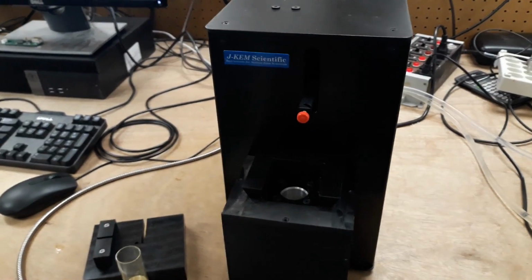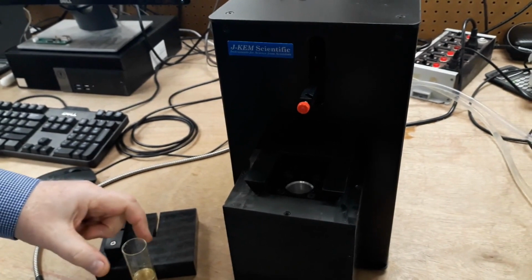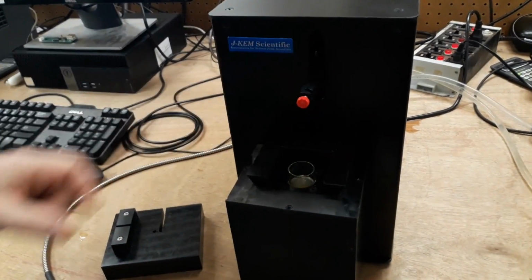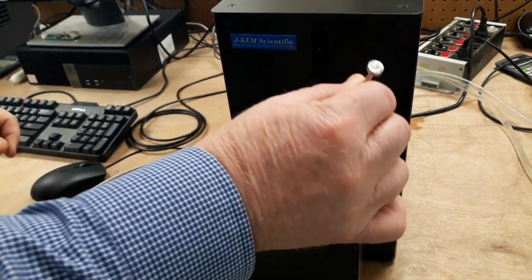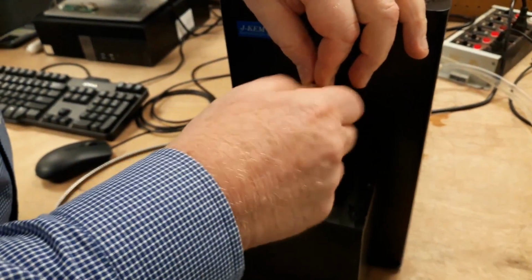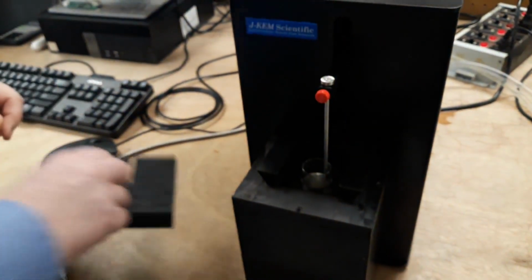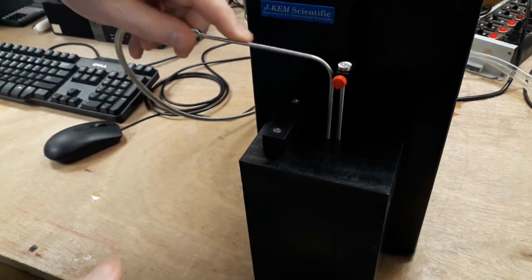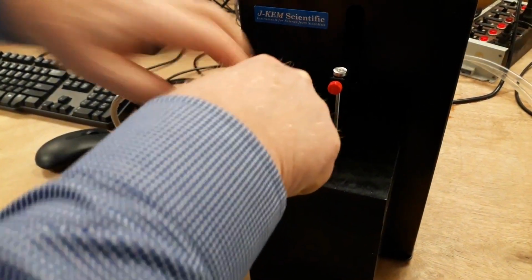This is a demonstration of the J-KEM Titer machine. You first would simply take your sample and put it inside of the Titer cell. There's a stir bar that goes in the sample. Tighten it in position, place the cover on, and then put your temperature probe into the sample.